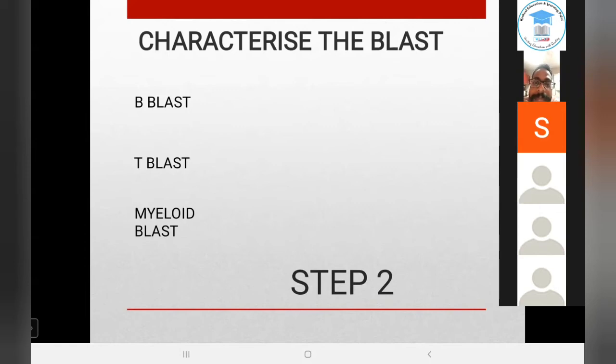But a lot of times, if you start doing flow and you start correlating, then you realize how many times you're wrong. It's actually a good exercise. Once you start doing flow cytometry, you should do a morphological analysis, then a flow cytometric analysis, and then correlate: were you right morphologically or not? Because eventually, objectiveness is what is important. You have to treat the patient.